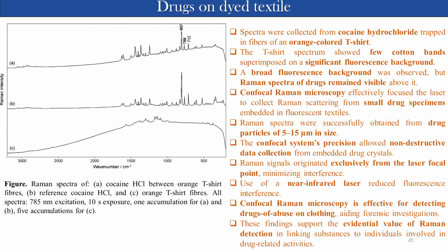If you have some short question, you can ask now. Any question? Sir, I have a confusion: what is the fingerprint oil? Is it any solution or the production of our sebaceous gland? Yes, it is the production of our own body secretion. It is also being tested by the spectrum. Yes, because finally, if you have a fingerprint, that fingerprint will have your own oil, this hand oil, and then protein, and then scalp. Everything is studied separately.